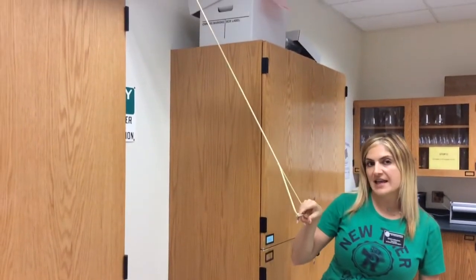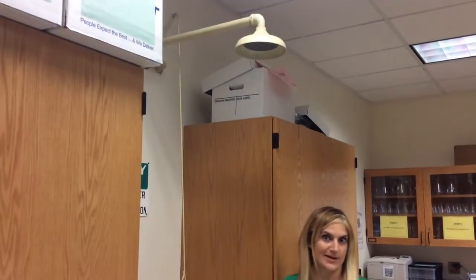This triangle right here is the handle. You pull down, which I'm not going to do right now, and the shower comes on. So what do we use the shower for? That's more of a chemical spill. So you're working with some sort of a chemical. I don't know, let's say it's acid and oops, you spilled it on yourself.